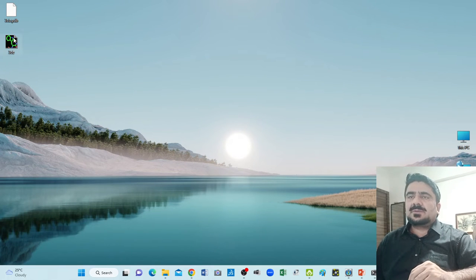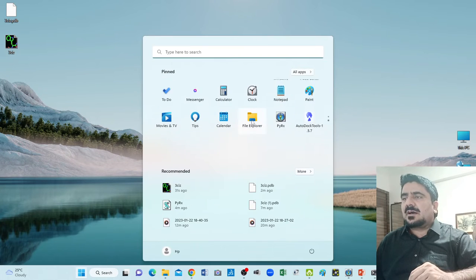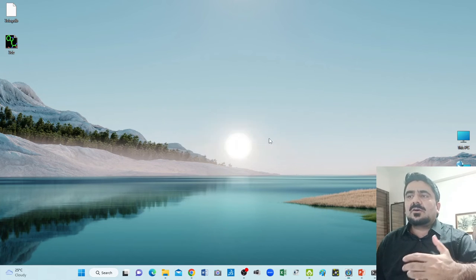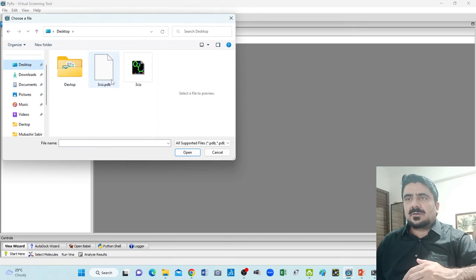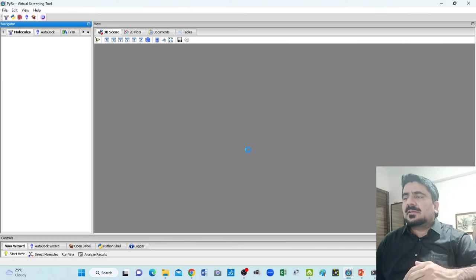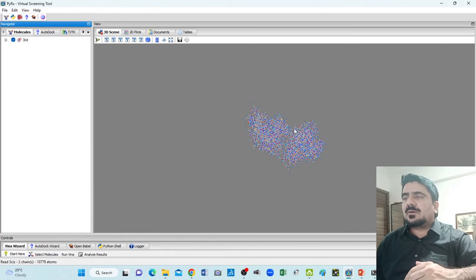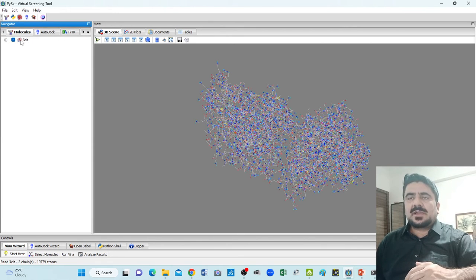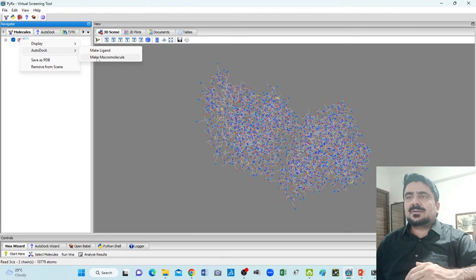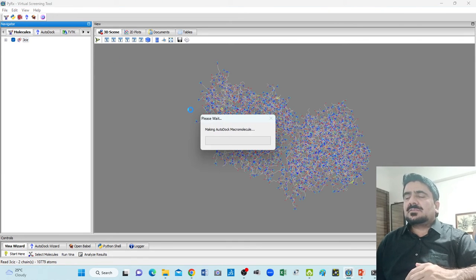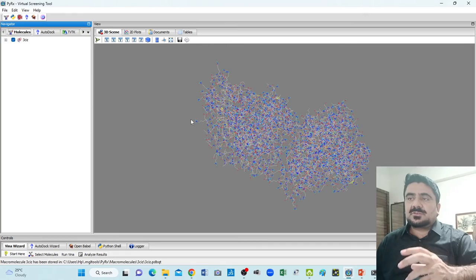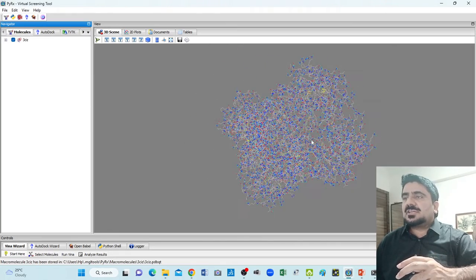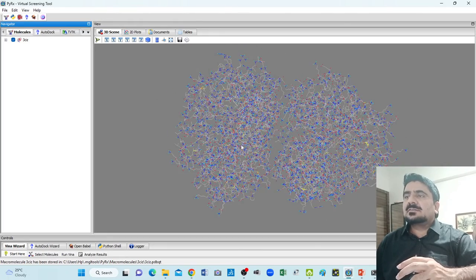Now we have the PDBQT file. In the next step we are moving back to PyRx software. We will learn how to upload it. Go to File, Load Molecule, move to the desktop — here is our PDBQT file. Click Open. It will appear on the PyRx software window. Check — it has two chains. Now to change it into a macromolecule, right-click on 3CIZ, move to AutoDock, and select Make Macromolecule. Click Make Macromolecule — it will successfully change into a macromolecule.